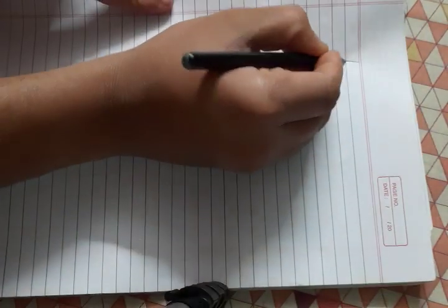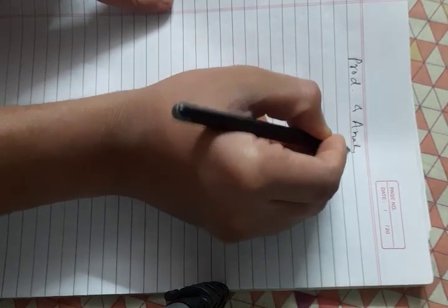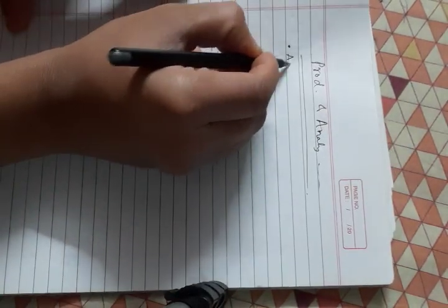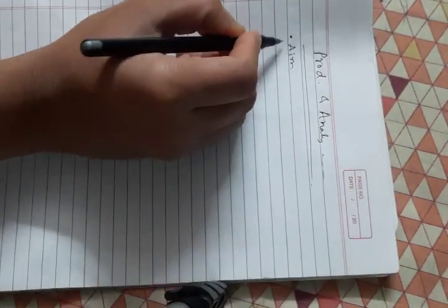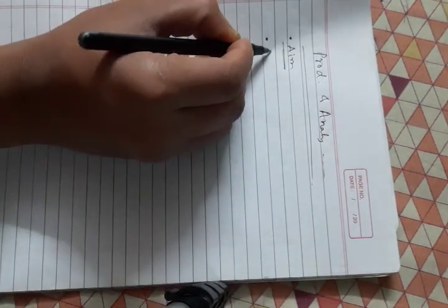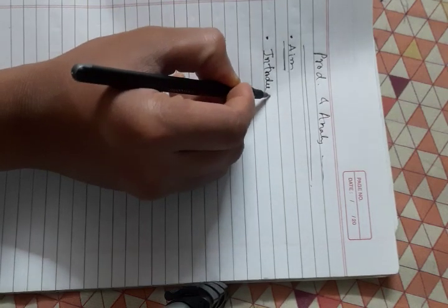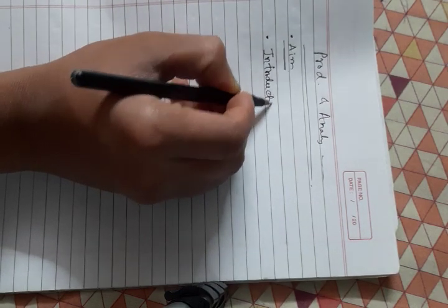Today I'm going to explain the production and analysis of amylase. The topics are: first, the aim, that is the production and analysis of amylase. Then the introduction, or the process, or the principle.